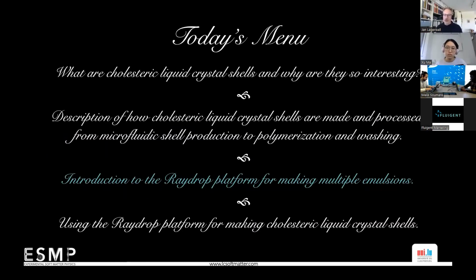So this is what today's menu looks like. First, I'll show you what cholesteric liquid crystal shells are and why they are interesting. Then I'll give a description of how they are made and processed, covering the microfluidic shell production, of course, and the effects of polymerization and how we wash them and why that's important. Then I'll hand back to Adam to present the RayDrop platform.